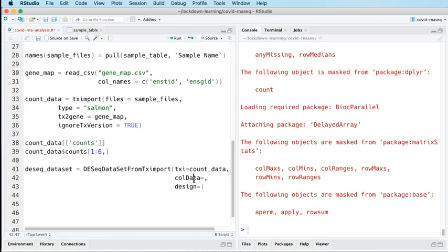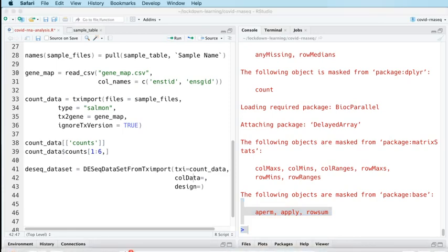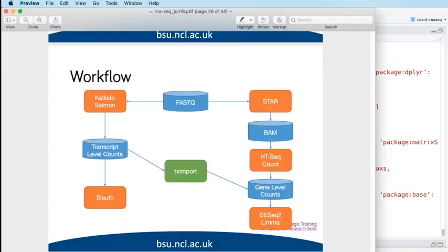So the way that your count table is formatted is that, I'm just looking for my whiteboard, which is not running. Doing well today. I think it's that one. No, not that one. Right, whiteboard, there we go. Sorry. Stick that up there. Open up my whiteboard. Make sure it's running. And then we'll talk quickly about the way that our data is organized. Actually, I can show you the slide that I was going to show you in a minute.